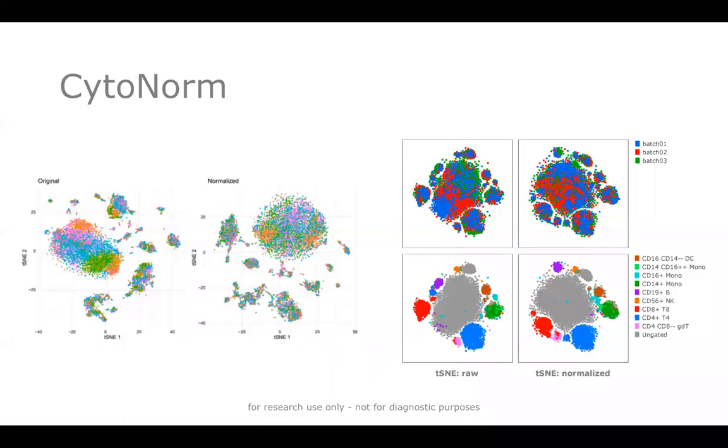Okay, next up is batch effect correction for flow data. This is the CytoNorm algorithm. I'm just showing you some different examples, both from the paper and also some that I ran in FlowJo. The whole idea here is that as you collect data across maybe weeks or months or even years, your data will drift somewhat just due to the technical variability that you experience in the lab. This could be down to different technicians dealing with the data, a whole different flow cytometer being used to collect the data, or just differences that occur across time, like PMT drift across the PMTs.